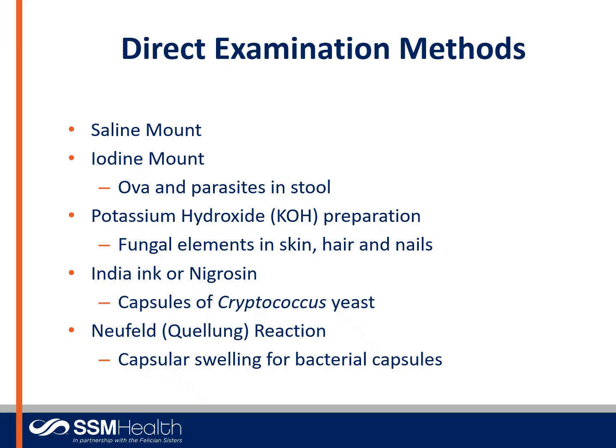Potassium hydroxide, or KOH, is a preparation that might be used to look at direct specimens for fungal elements. This is particularly useful looking at skin, hair, and nails. The type of fungus called the dermatophytes are infections particularly in these parts of the body, skin, hair, and nails.